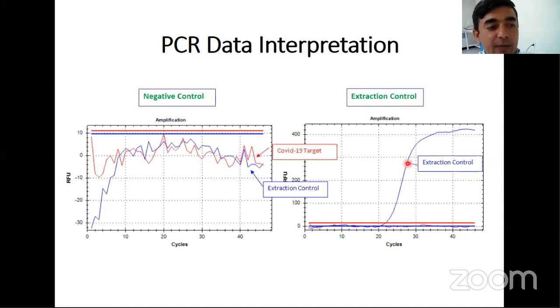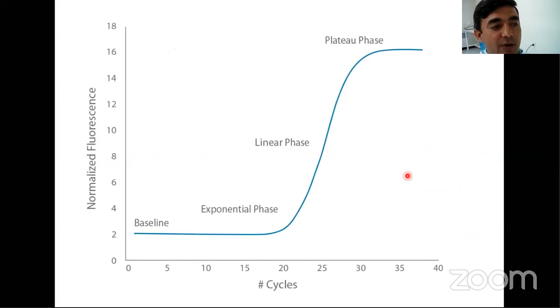So during a batch of the automated extraction process, whether this is a 96 well machine, a 32 well machine, or a 24 sample extraction machine, processing 24 samples simultaneously at a single extraction time, in all of these machines we use one of the wells for extraction control, and it validates whether the extraction performed is valid or not.